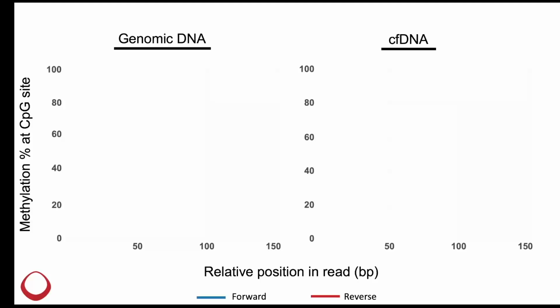Now, methylation is not distributed randomly across the genome, as it regulates expression in differentiated cells, active regions, silent regions, heterochromatin, all that good stuff. However, when we look at the methylation signature of bulk genomic DNA, what we're essentially seeing is just an average across many chromatin states and often many cell types.